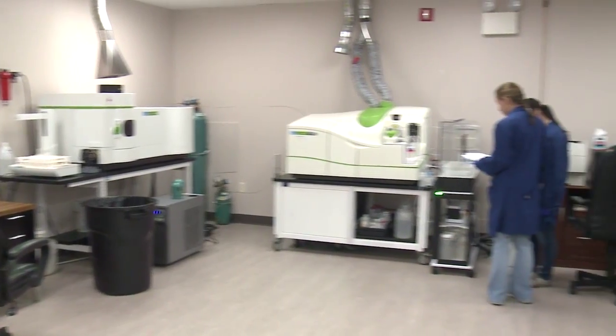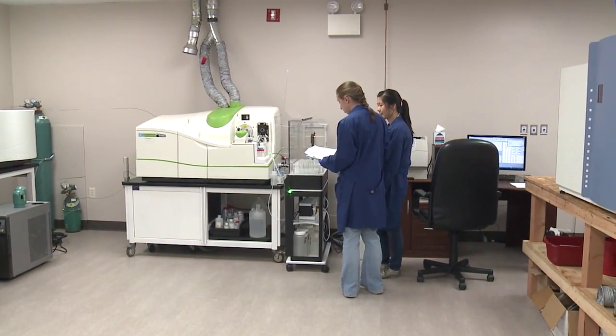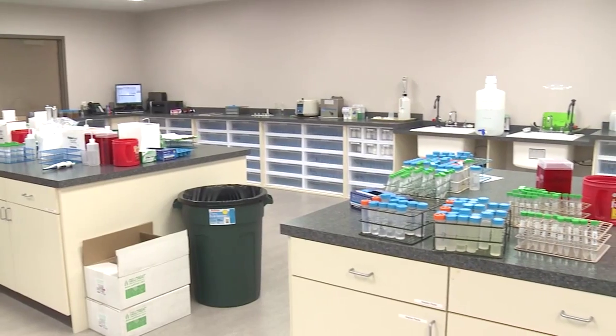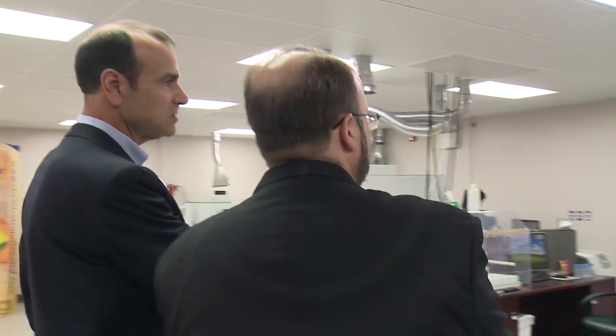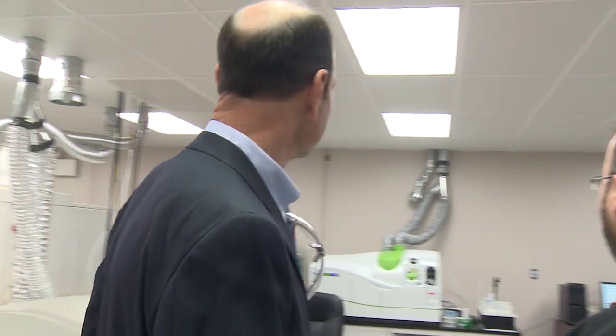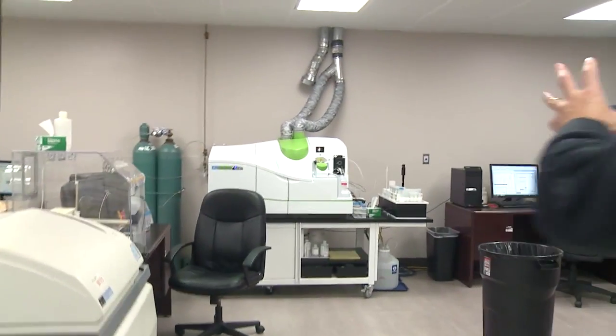Okay. Our final spot is the instrument lab where we do all the analysis. This is where it all happens. We reduce everything we do down to a clear liquid, and that all gets stored in those bins around the perimeter. The clear liquid then goes into our instruments, well, as you would refer to them, inductively coupled plasma mass spectrometers. Yes, of course. That's one of the little anecdotal things we discussed when you were here.